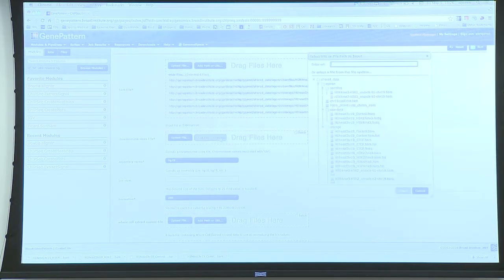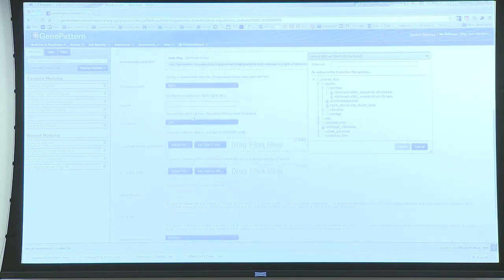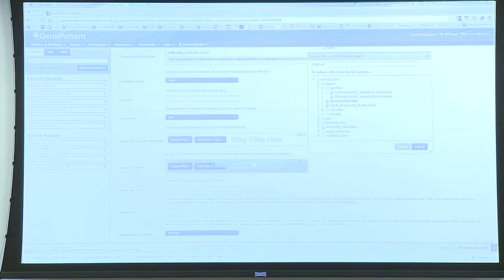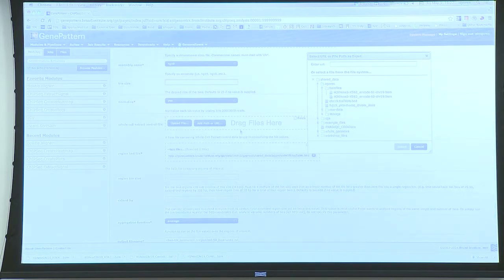The next step is we need chromosome sizes, which just make it easier on our eyes. We have HG19 chromosome sizes, so I drag it here. We also need the bed file. I make sure that I take only the chromosome 19 bed file. What is bin size here? What is the upper bin size? So a default is to take each and every one of the chromosomes and count how many reads were falling in consecutive bins of 25 base pairs. You can change it into whatever you want. We didn't use this one. We used the one down below, because it's a different one.